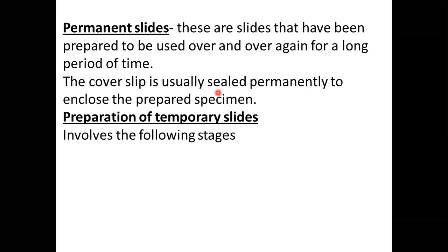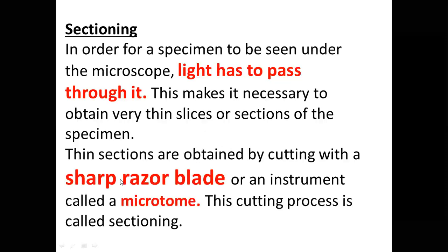So it may not necessarily be photographs, as it was in 2018. NEC can easily supply slides and they can be used in an exam, or we are made to make one because it's not very difficult. On the other hand, we have temporary slides. What we normally observe in our schools are either permanent slides, the ones which are already made, or the ones which are temporary, the ones that we make ourselves.